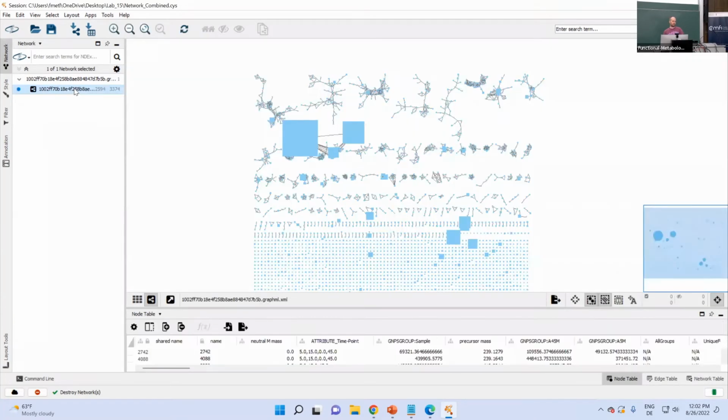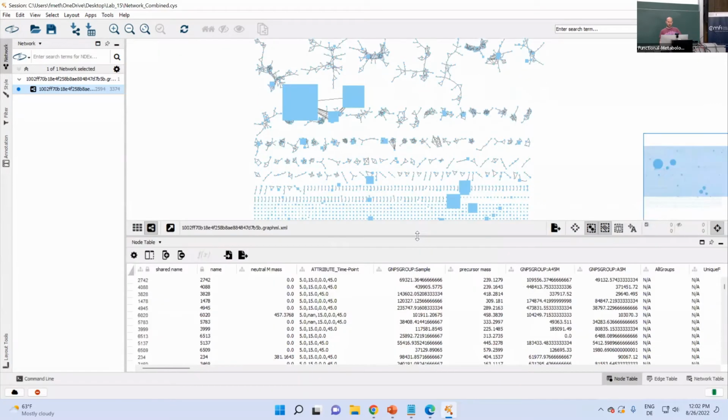So yeah, hopefully you have something like that. Whether you imported the Sirius results already or not is not so important. I think the main thing I would rely on is the library IDs anyway. I imported this as this TSV table that you got as a summary output file. If you want, I can quickly show it again.